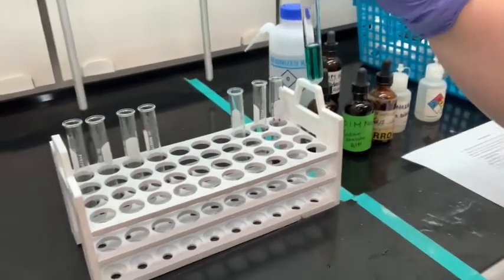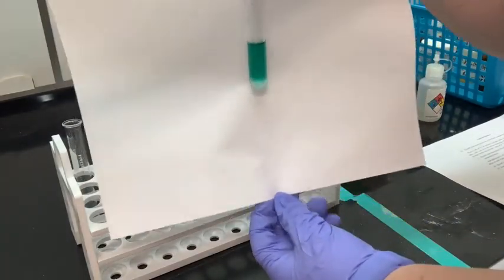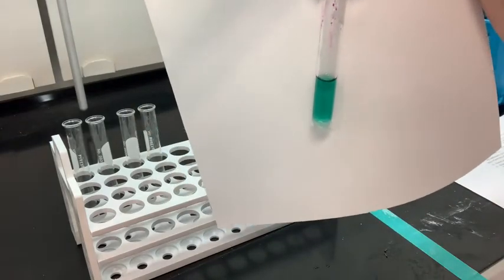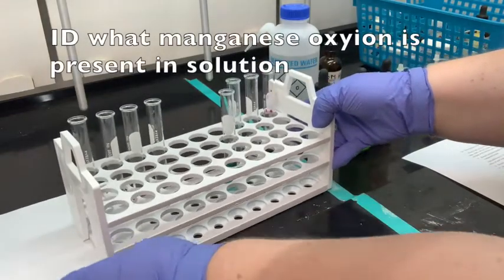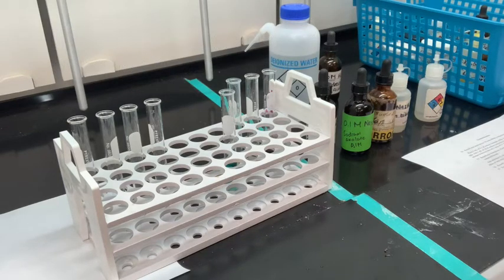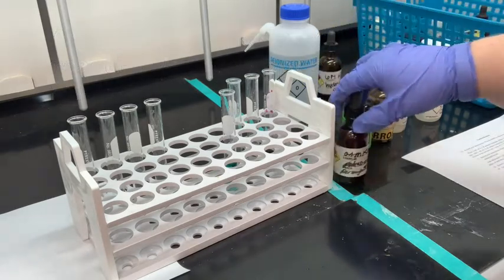Make sure you record your observations. The green color may be a little hard to see, but the solution has turned green. You can identify what manganese oxyanion is formed in that basic solution. That's for number 17. Now we want to add KMnO4 dropwise and observe the effects of each drop — we're going to add a total of 10 drops, shaking between each one.